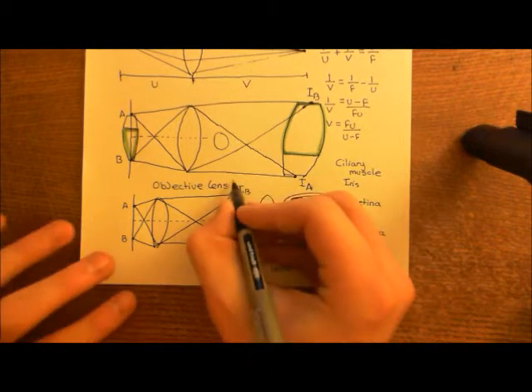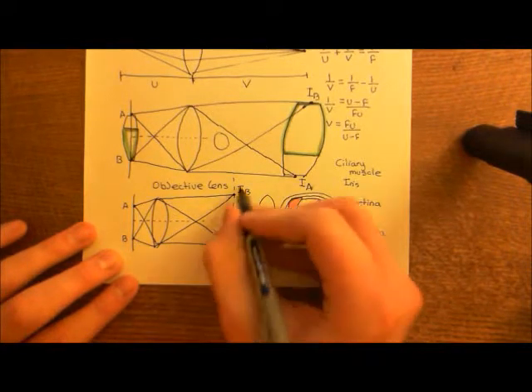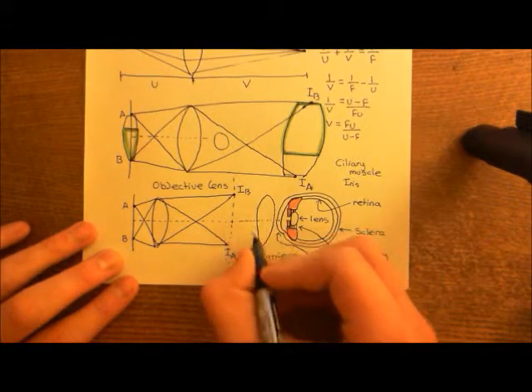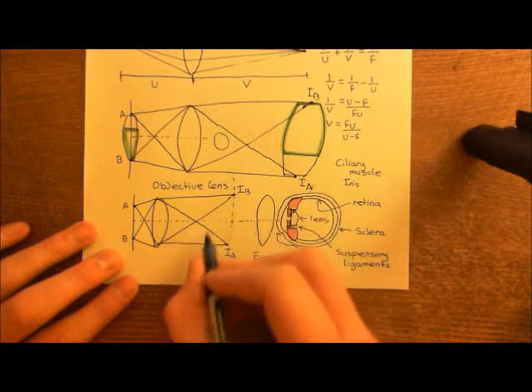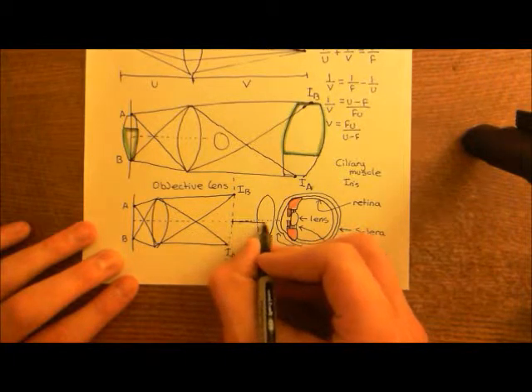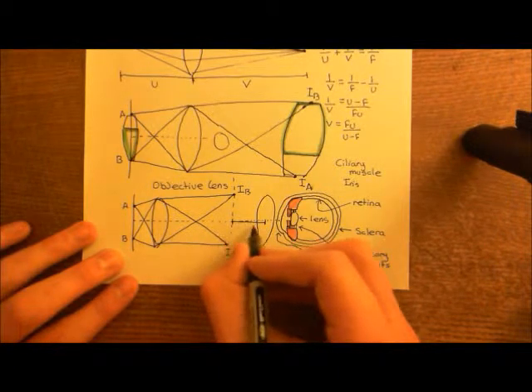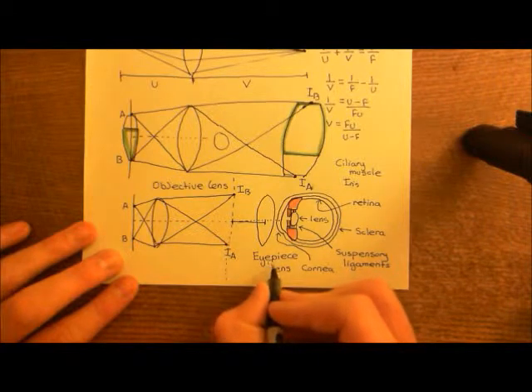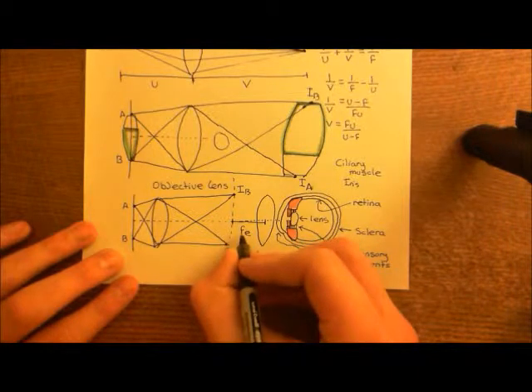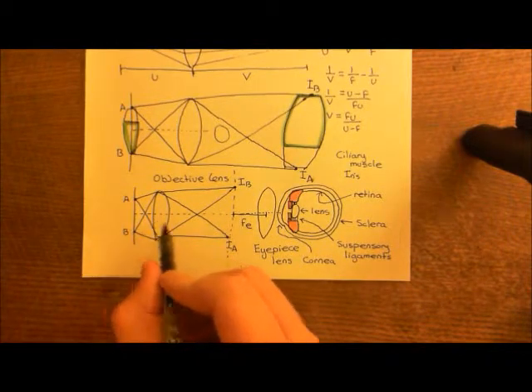Now, why is that so important? Well, because this upside down image is being brought into focus on this plane here. Now, you do not want this lens to be on the same plane as this image that we're forming here, but you want it to be a distance from this plane which is equal to its focal length. So let's call this the focal length for the eyepiece lens, so I'll put an E there, and it won't be the same as the focal length for the objective lens.